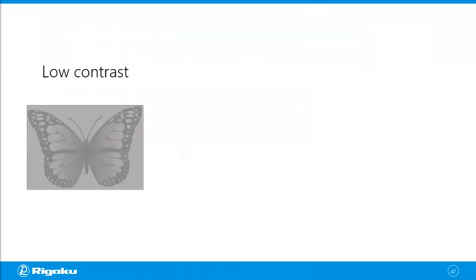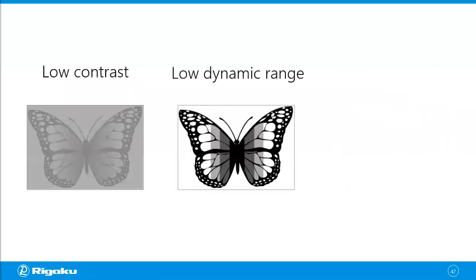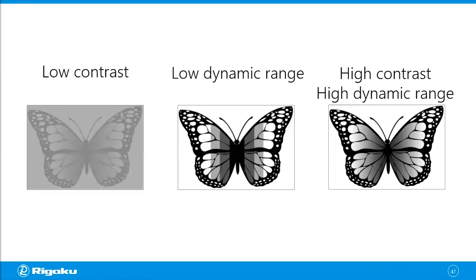Now what about contrast? This is a low contrast image — you don't have much variation in the gray level, making it difficult to see features. This image is high contrast but has its own problems: you only have four levels of gray — black, dark gray, light gray, and white — to describe density differences. That's not enough dynamic range. What you want is a high contrast, high dynamic range image.